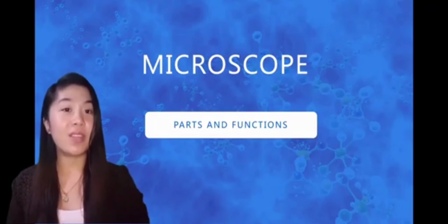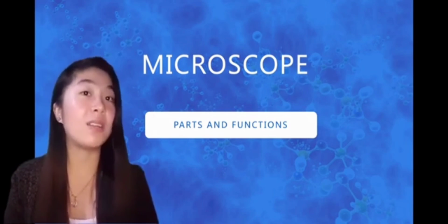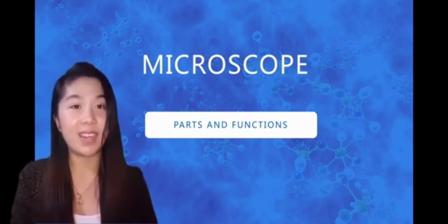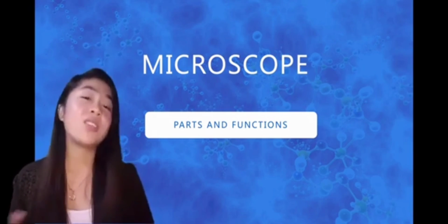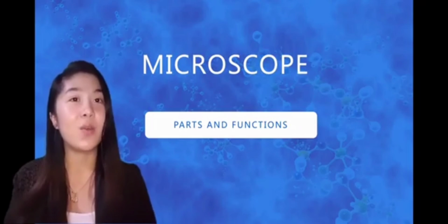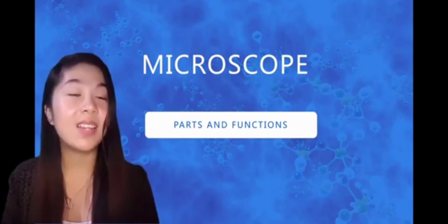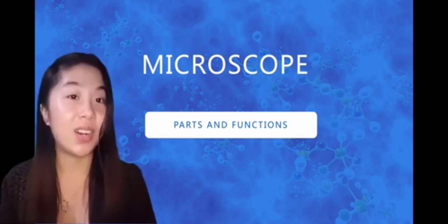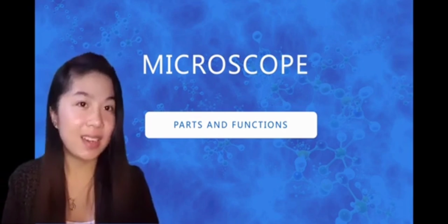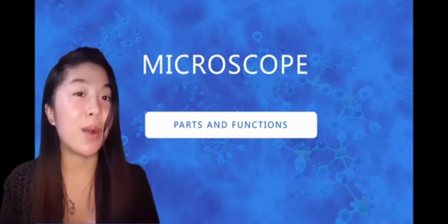So the conclusion of this video presentation: microscopes have long been an important instrument in the medical field. The world-changing discovery of germ theory, which saved countless lives, was made possible because of the microscope. As a medical technology student, the microscope is an important element of our education, and by understanding its parts and functions, we will be able to utilize it properly.